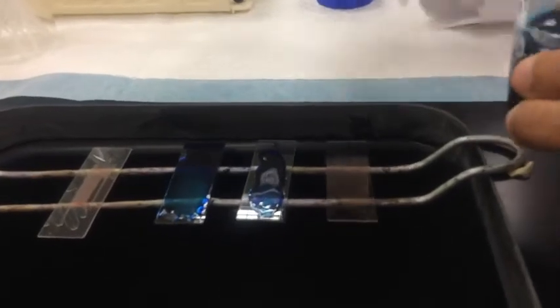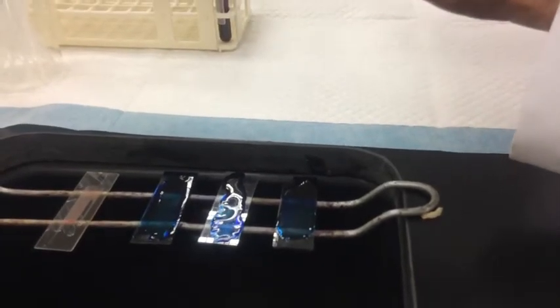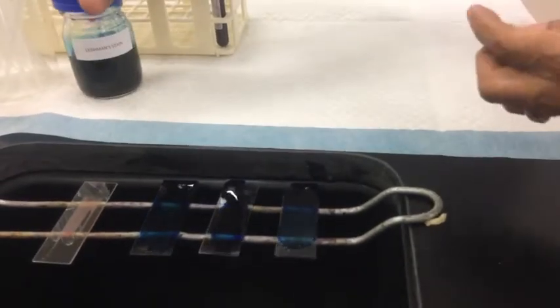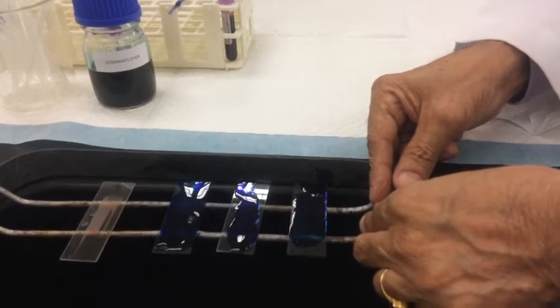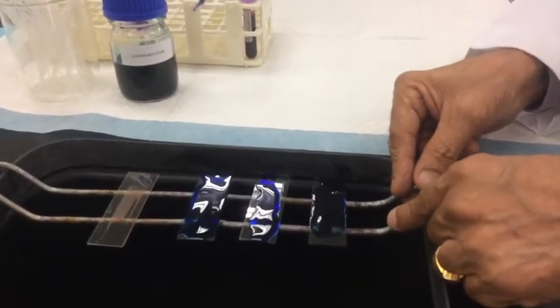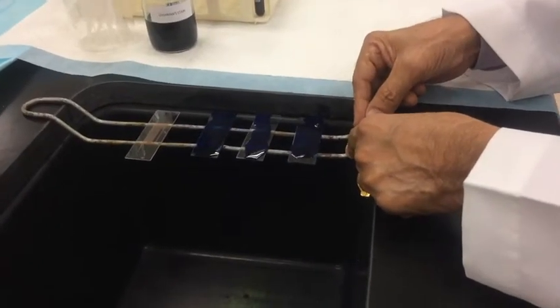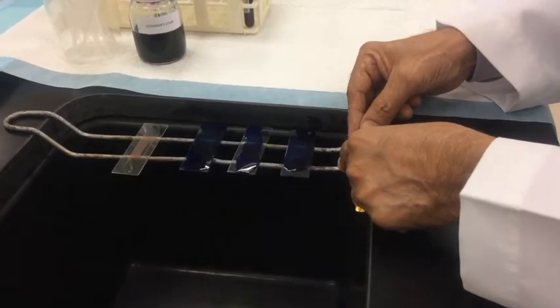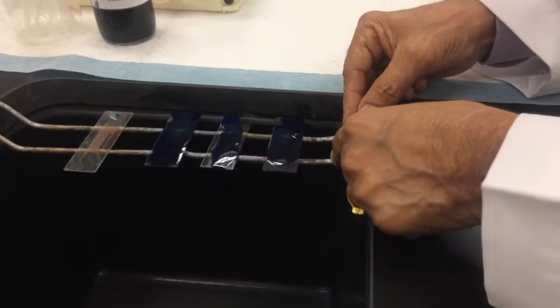Leave it aside for two to three minutes. During this time no actual staining takes place because the pH is not ideal. What is happening is the fixation of the blood film onto the slide. It is important to rock the slide slightly to ensure the stain covers the whole smear uniformly.